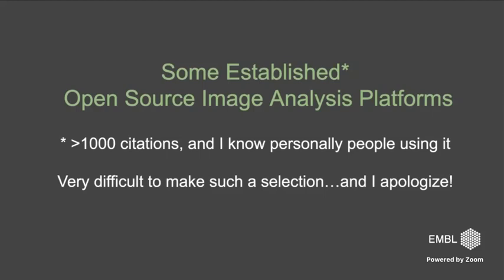Okay, then I want to do something a little bit less theoretical and talk about some actual platforms where you could do image analysis, and that's a really tough job because I have to pick something now, and there are so many. So I made the choice to present 4 of them, and the criterion was they have to have more than 1,000 citations, and I should personally know a couple of people at least that use them. I apologize for all the tools that I don't mention now. Again, this is a tough choice.